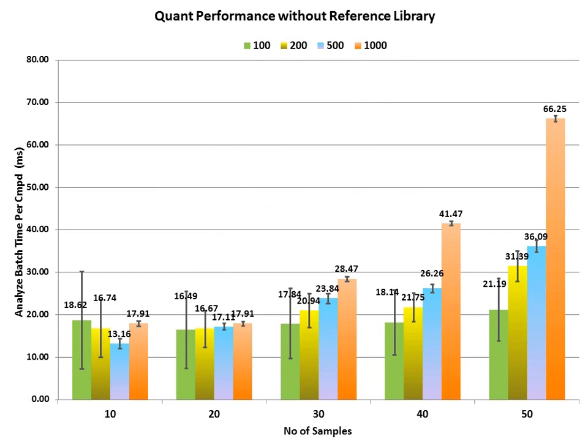A lot of detail, but the first thing to notice is there is a slight compound sample time increase as we move from 10 up to 50 samples. It shows a behavior at the high end, the 1000 compounds, which is often referred to as the performance knee.